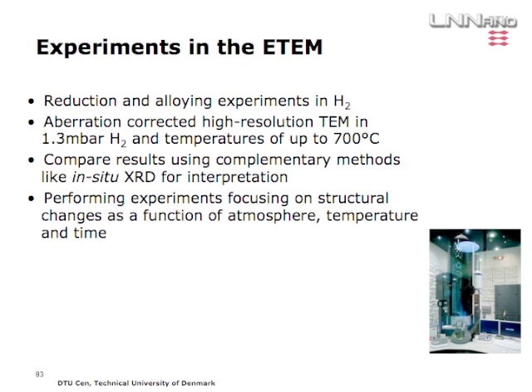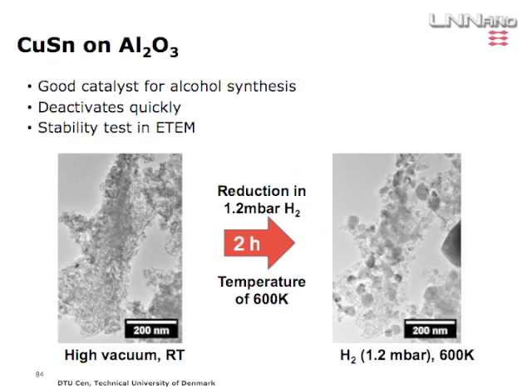Most of the catalysts that come out of this project are alloys. So we want to try to do the same thing in the microscope and see how stable they are, how they perform, and compare the results that we get from the ETEM with complementary techniques such as in situ XRD. We have actually built an inert transfer system so we can transfer our samples inertly from the XRD setup to the ETEM facility.